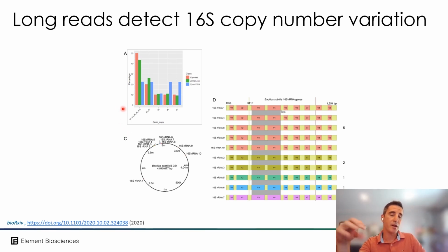You can think about this as a signature for strains. How many copies they have in the genome and the copy number for each of the unique sequences in the genome is a strain-level identifier in microbiome sequencing. This property is enabled by long-read sequencing, and it's almost impossible to detect using short-read sequencing.